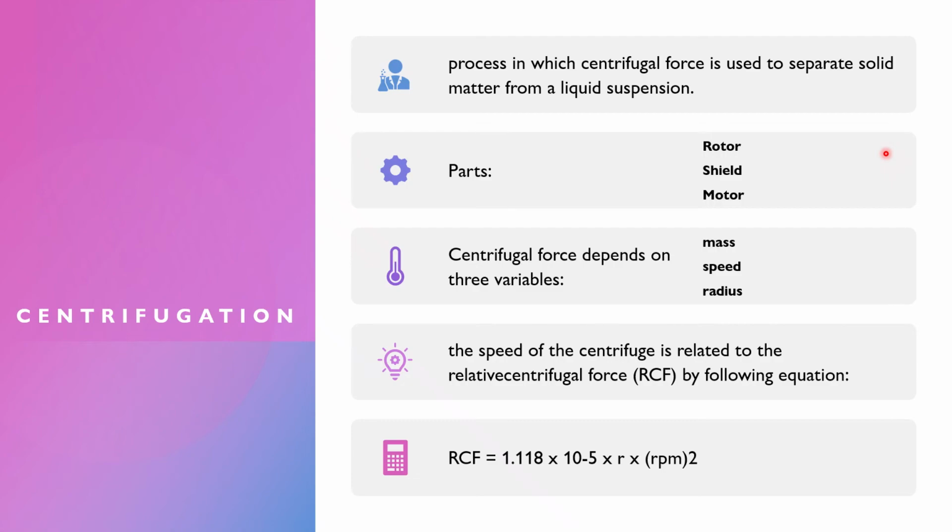However, many models include a brake or a built-in tachometer, which indicates speed, and some centrifuges are refrigerated due to its very fast centrifugal force. It needs to be refrigerated. Remember that if there's too much friction, it can cause heat and spark, and that may be a cause for fire, so fire hazard.